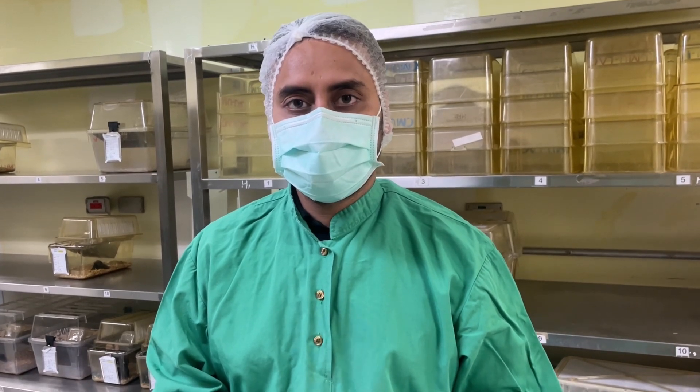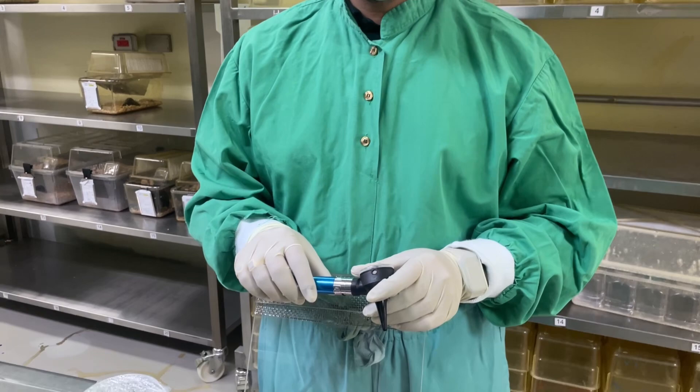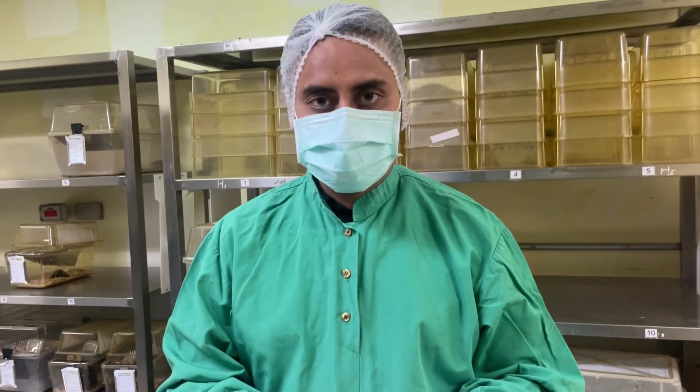Hello everyone, myself Dr. Bhaskar Singh, and today we are going to demonstrate how to give an intratracheal gavage. In order to give an intratracheal gavage, we use an otoscope.